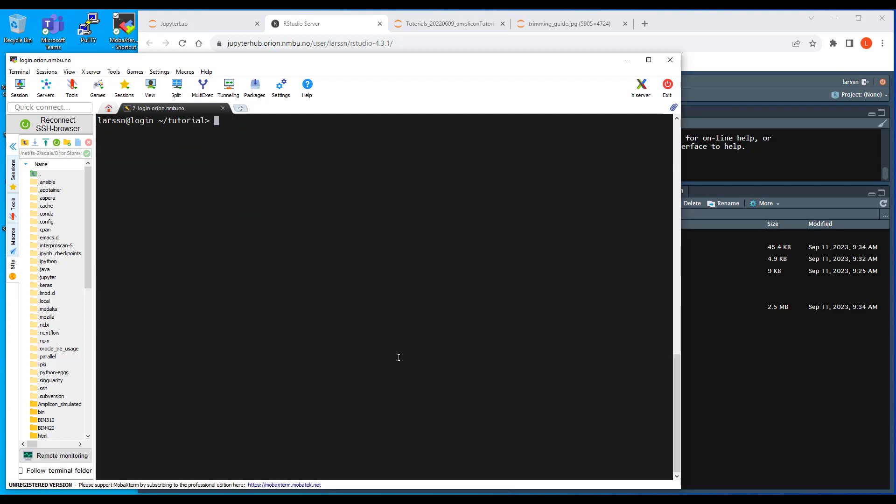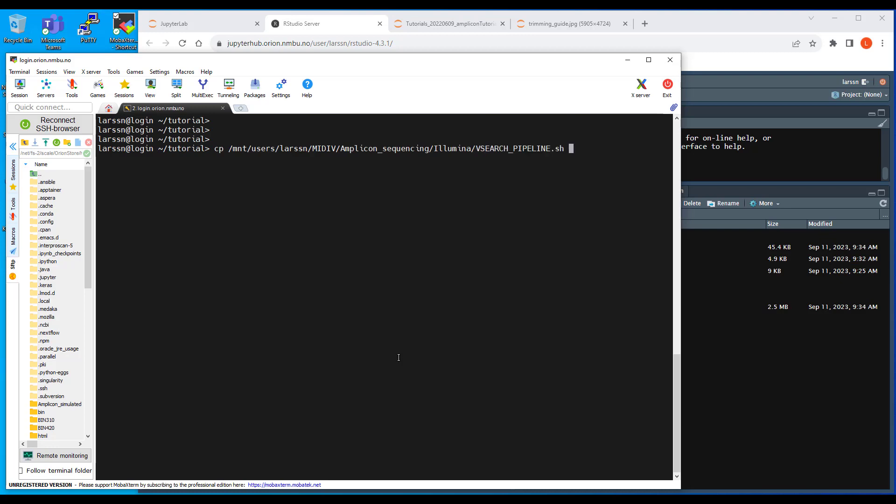Well, first of all you need of course to have the script itself. So it's again under my home folder, mediv-amplicon-illumina, and there should be a script called vsearch pipeline with capital letters. Copy it here.